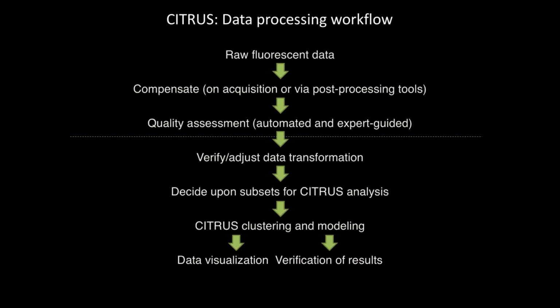So you know that minimum cluster size in Citrus is defined by the user, and setting this parameter to a small number will allow smaller, more rare cell subsets to cluster cleanly. But that will also reduce statistical power to detect associations. So if you know that your data set contains both large but roughly uniform populations and small populations, it may be tricky to get one run of Citrus to compare all subsets.